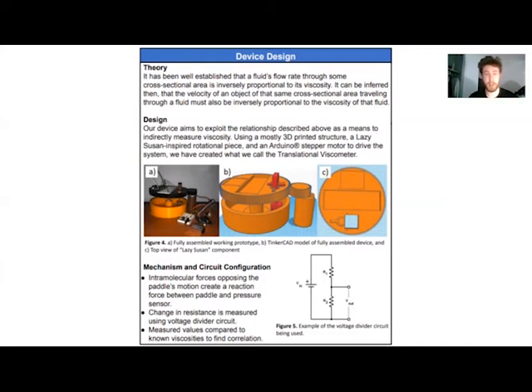And then lastly, how that force is actually being measured. We're using a simple voltage divider circuit. We've got a variable resistor, which is our pressure sensor, in R1's position, and then a known resistor in R2, and then our known constant voltage source. And then we're just measuring the voltage in between the 2 resistors and then mathematically solving for a change in resistance.